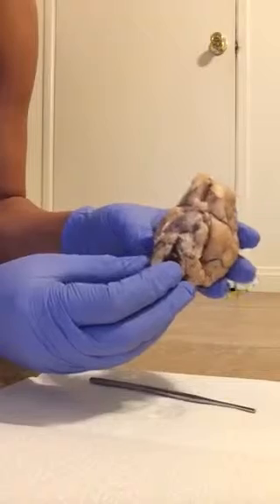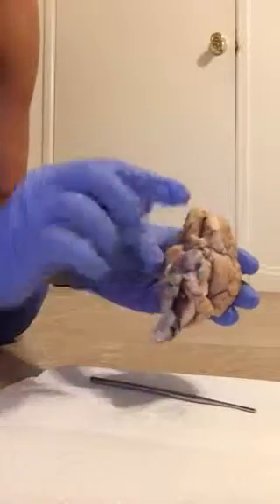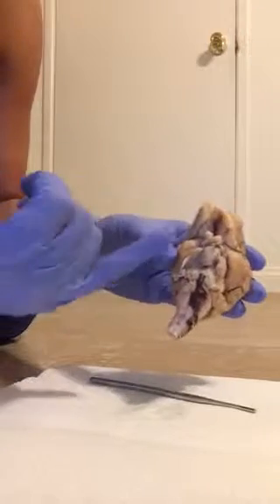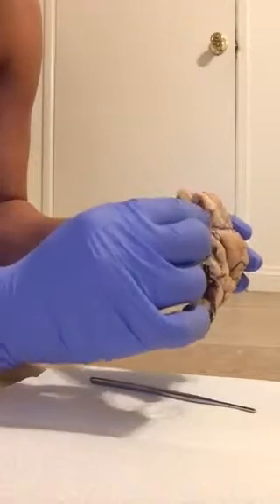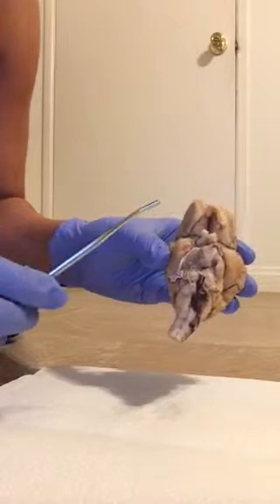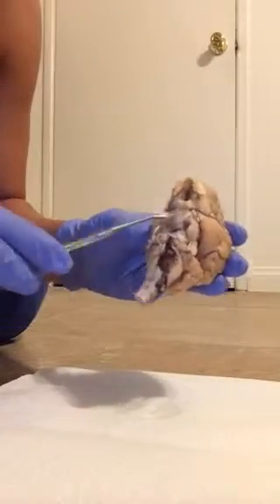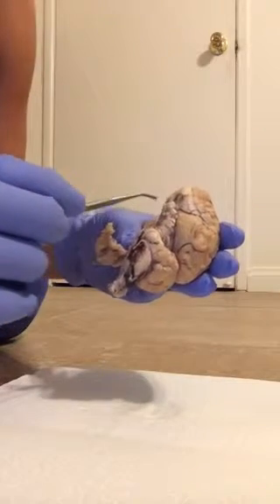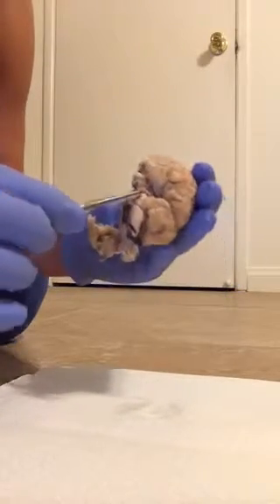And we'll move into the ventral surface. We have our olfactory bulb, which is going to be these here, and our optic nerve, of course, is here. Our optic chiasm, which is here, connects the two optic nerves. We have our trochlear nerve, which is a very small one here.